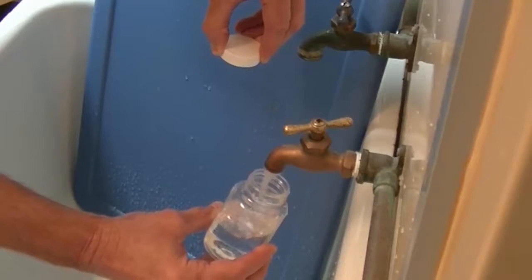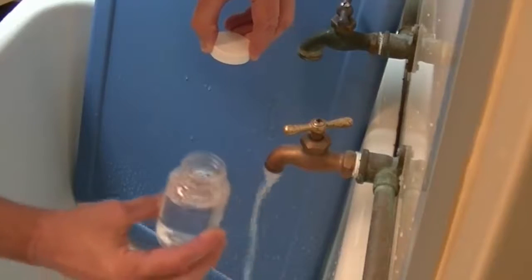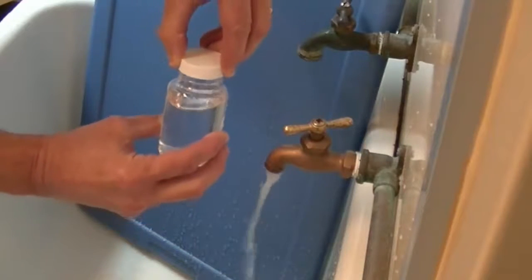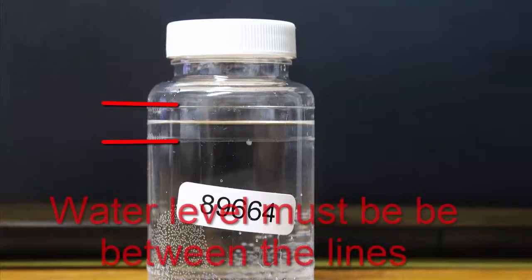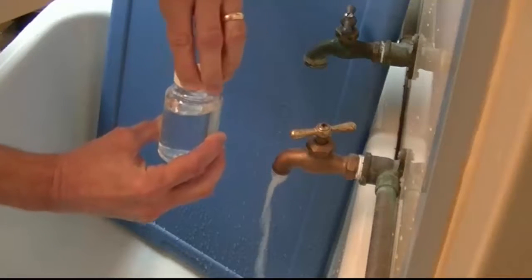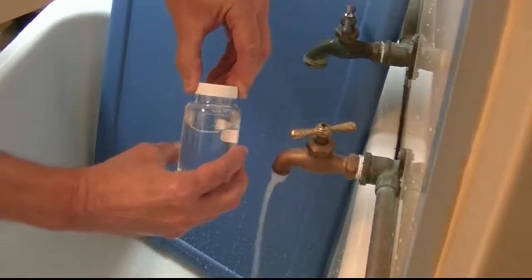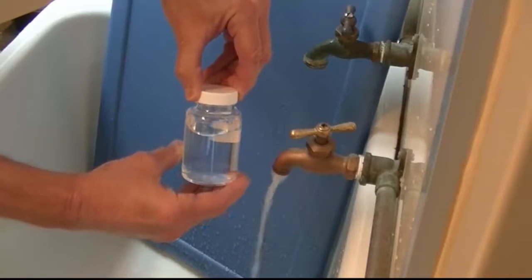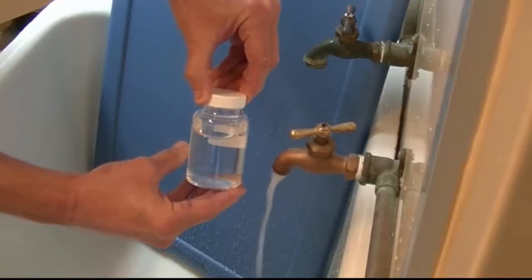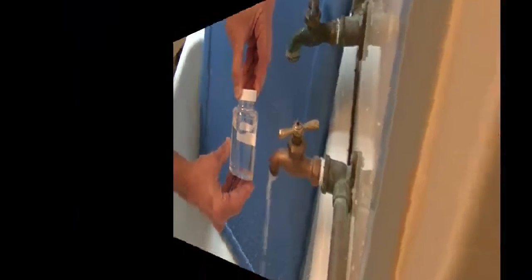Fill the sample bottle between the 100 milliliter line and the 120 milliliter line. If you fill the bottle below the bottom line or above the top line, the sample will be rejected. Carefully recap the bottle. Be sure not to touch the threads on the inside of the cap or over-tighten the bottle. Touching the bottle cap threads can introduce bacteria, and over-tightening the cap might cause the lab to reject the sample, which would trigger a replacement sample requirement.